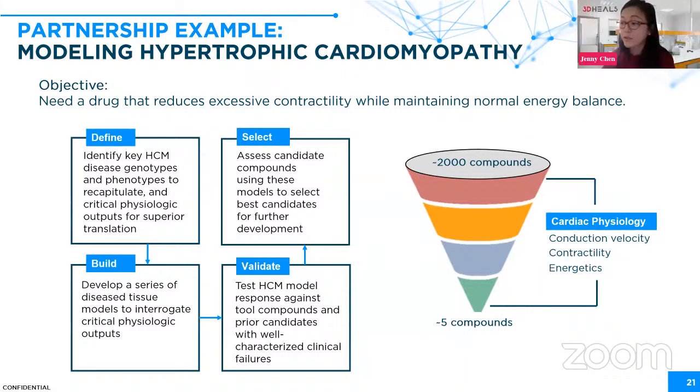Right. Actually, another question of mine is, yes, you can produce a functional piece of tissue, but how long do they last? And do you need them to last as long as an animal or some other equivalent, like 2D? Yeah, a lot of our metrics today are taken at day 14, so 2 weeks out. We print our tissues, we keep them in culture for about 2 weeks, and that's very early.